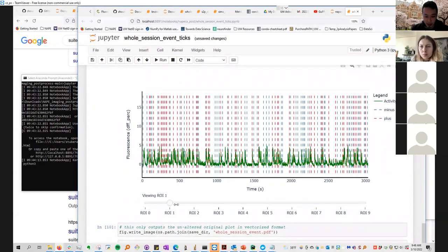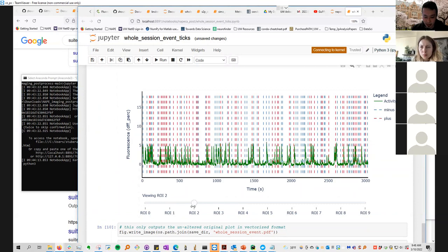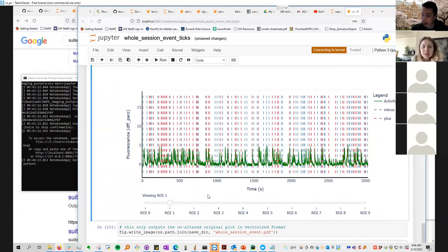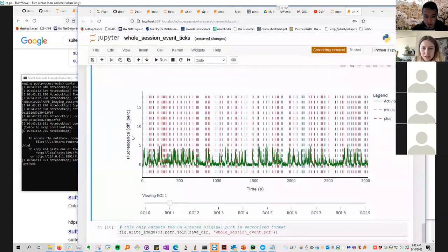Okay, so again, you can scroll through the different cells, the extracted traces, and then also, let's see. I have a quick question. On one of the cells, I'm getting a warning that there's no or multiple signal files detected, using the first detected file.